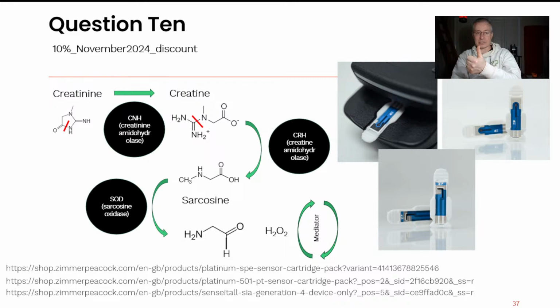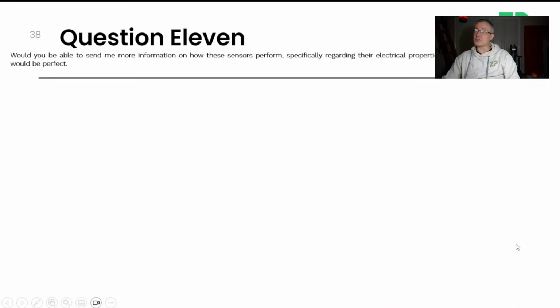Creatinine, just do it on a carbon electrode without any enzymes. The enzyme system, at which point you detect it on platinum, or the most commercially viable, useful way is adding the mediator at the end and doing it on a carbon electrode. So I hope that is useful.